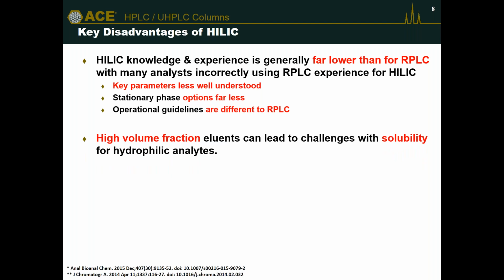One of the other challenges with HILIC is that because we use such large amounts of organic solvent in our mobile phases, and typically in our sample diluents, sometimes this can be quite challenging with regards to solubilizing our sample mixtures. It's very odd that HILIC as a technique is ideal for the analysis of polar compounds, but actually getting polar compounds to dissolve in high amounts of organic solvent can be a real challenge. And this is certainly one of the challenging areas for HILIC.